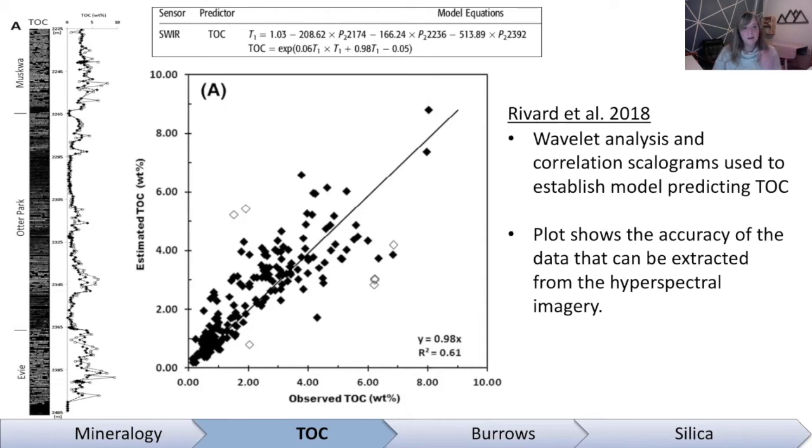you're doing spot analysis through sampling. Of course, it's quicker, right? So you can actually, just like an XRF, you can run through with a hand analyzer, or there's some that are mounted, but it wouldn't produce the imagery. So you can take high resolution photos.